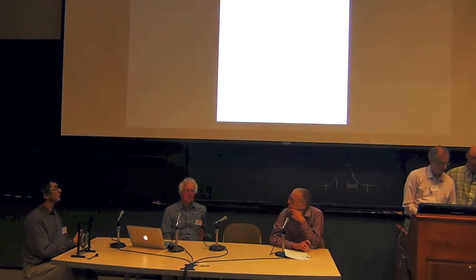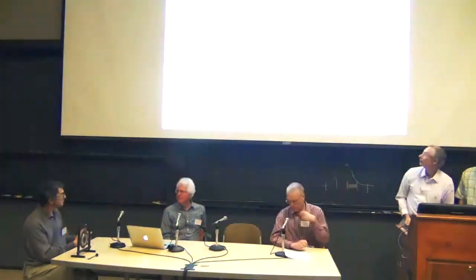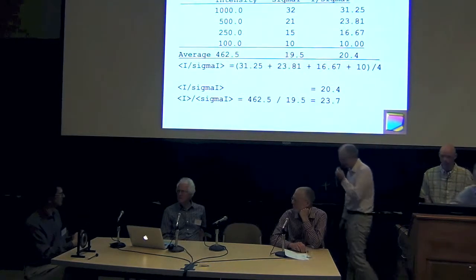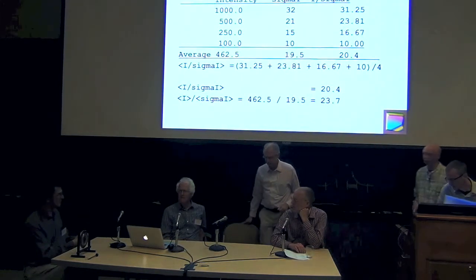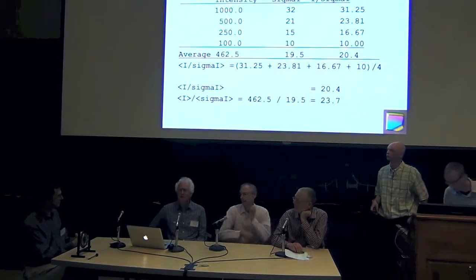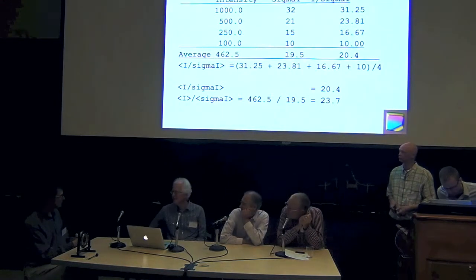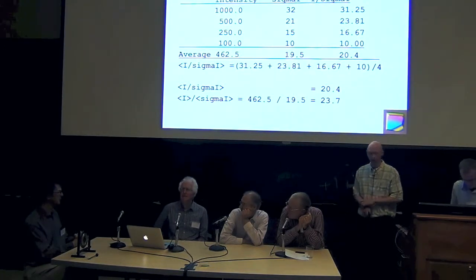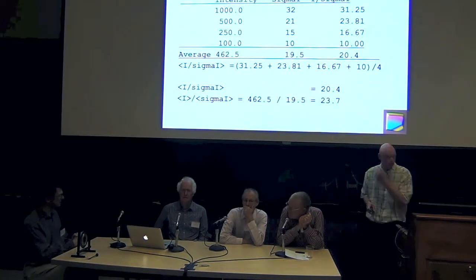It's also this completeness: is it in the sense of Bragg's law, or completeness in the sense of informativity, say like ellipsoidal resolution? The word completeness is not very well defined, and in fact, in programs like CTRUNCATE or TRUNCATE, they remove what they call uninformative reflections, but use somewhat different criteria. So definitely some reflections are lost during intensity to structure factor conversion. No, this can be the average expected intensity is low. So there is some kind of informativity effect there, like sigma to expected intensity.